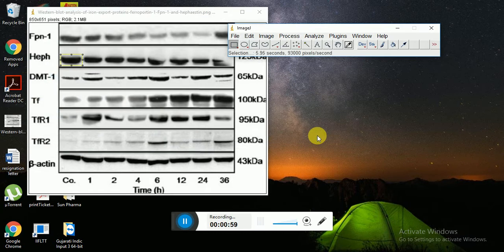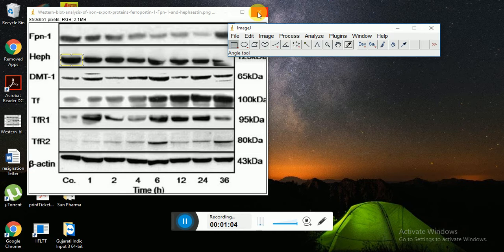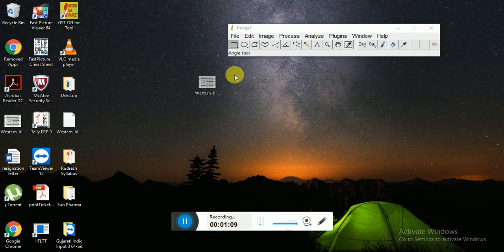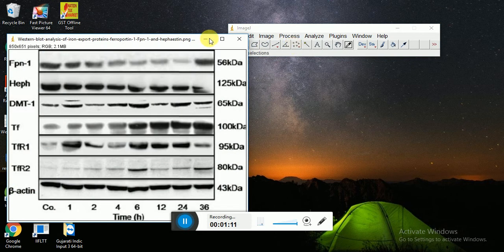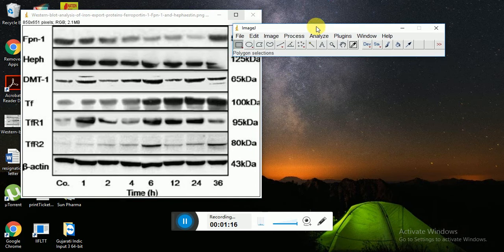Now if you want to change to another blot with the same protein, suppose I am closing this and opening this again, and I want to use that selection uniformly to all the blots, then I have to just go for file open.